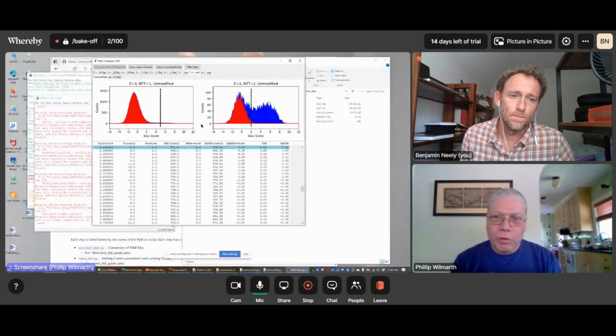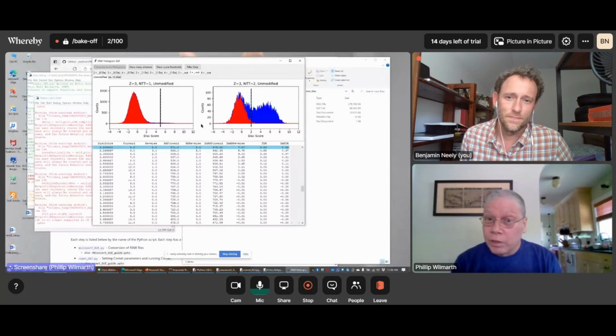So the instrument does acquire those kinds of scans, and they're somewhat dependent on whether the instrument's got something better to do or not. So at the beginnings of your gradients or the ends of your gradients, where sample complexity might be lower, the instrument might have everything that it's already seen taken care of in dynamic exclusion, and then it's just cruising the noise level to find other things to sequence. And I think Thermo has these methods where you can exclude 1+ ions, or you can exclude things that don't have an isotopic pattern. And then the methods often have the option checked to just take scans if you've got nothing else to do. So it's sort of this catch-all mode. Why have the instrument just sit there idle? It'll acquire scans of these very low quality precursors.